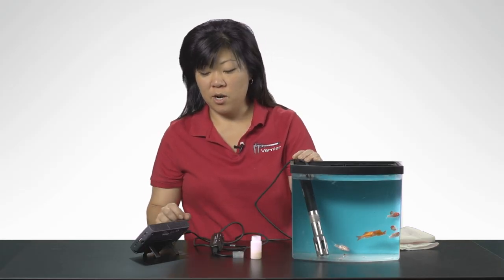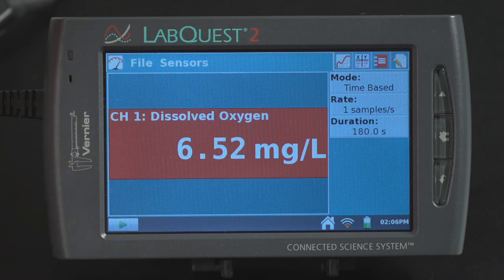The reading of this fish tank is approximately 6.4. It will take 40 seconds for the DO probe to reach 90% of its final value, so you may want to wait a few minutes for this value to stabilize.